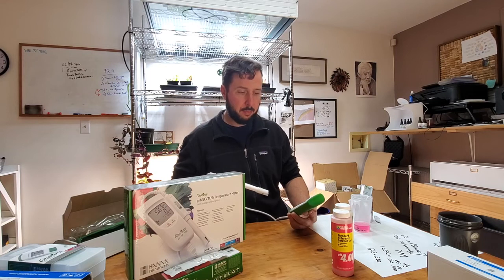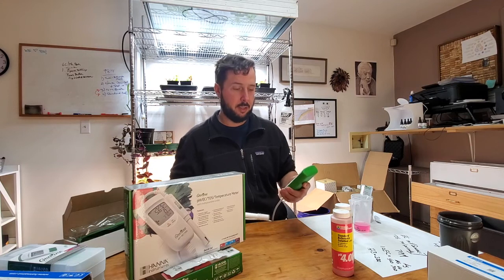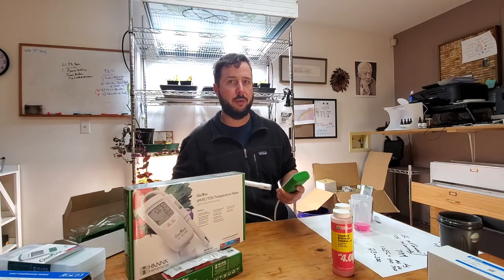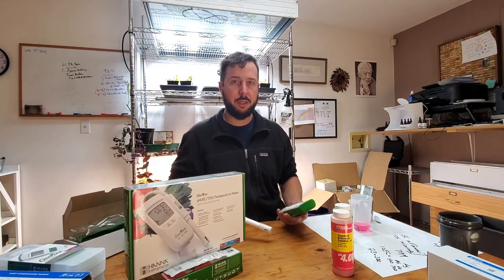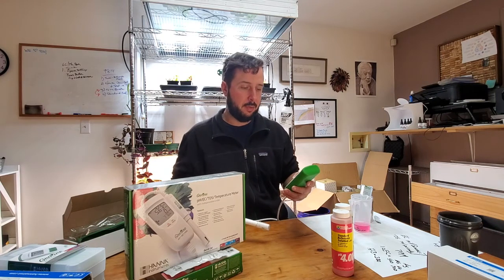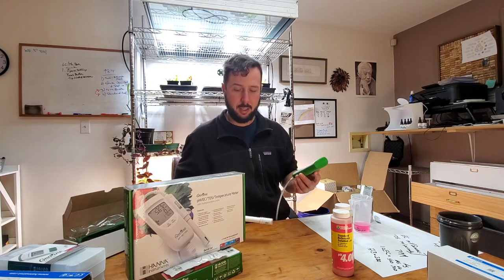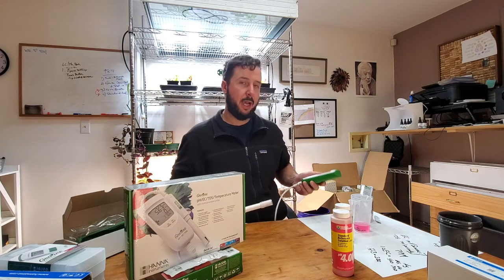There's a probe indicator mode in here that you can get into with standard calibrations — that'll actually tell you the health of the probe. It only monitors the health of the probe for 12 hours. I'm not sure how valuable that feature is, but there's something in there if somebody wants to get to that level. The temperature reading, the readout, everything is really accurate. I've had a really easy time using this. The hardest part is getting into the menu, getting everything set up and getting familiar with it. Once you do that with the quick cal, it's kind of no going back.